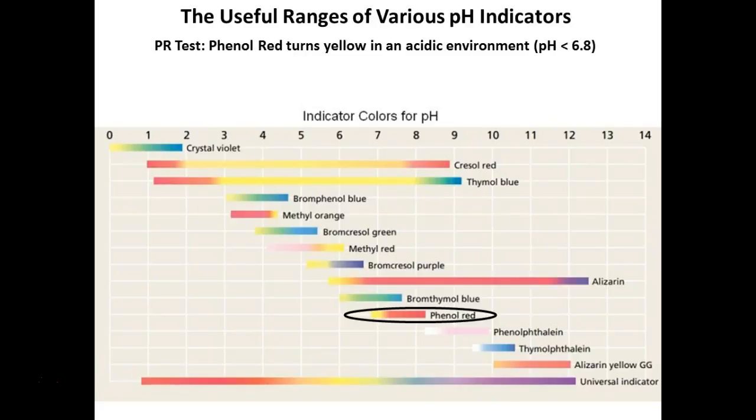We'll go over it again. Will a phenol red organism necessarily be methyl red? No. Right? Not all you guys that were phenol red yellow were methyl red red. Right there it tells you no. And again, that comes into that we're dealing with different pH indicators, different pH ranges.